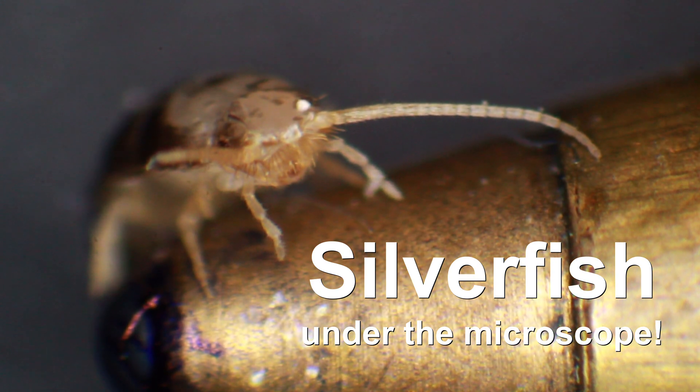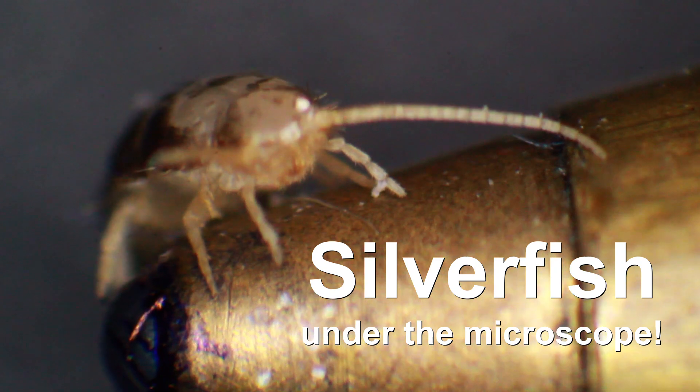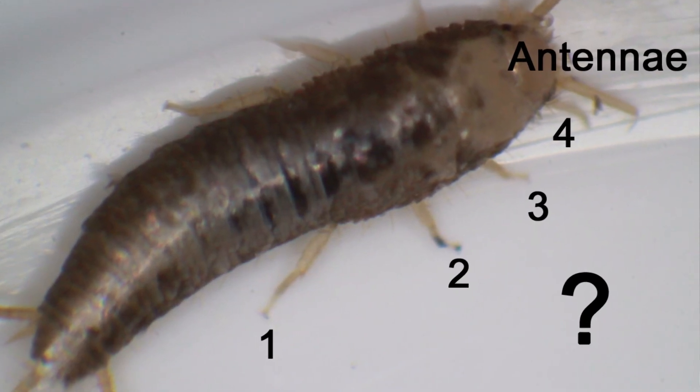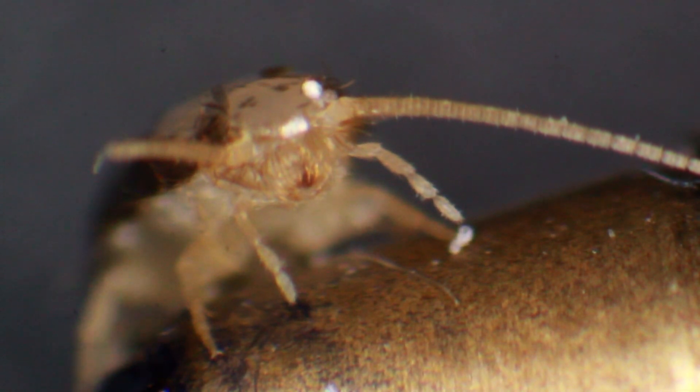Here is a silverfish sitting on a pen. It's an insect, of course - not a fish - and it's therefore supposed to have six legs. But under the microscope I counted eight, so something seems to be really wrong with this insect here. Or maybe not - we'll find out.